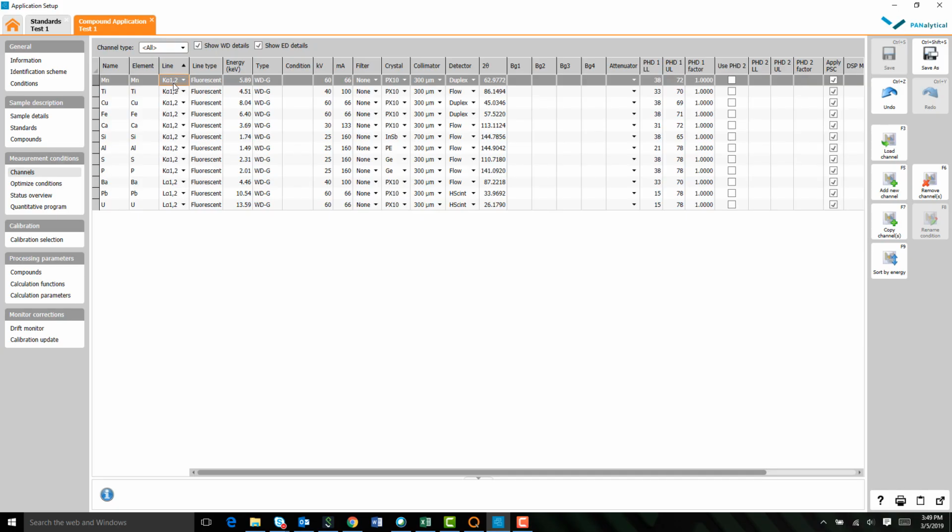You might have overlaps. You might have a lot of intensity from a certain element, and you might not care about K alphas. You might want to use a K beta. Perhaps a K beta is not giving you overlap issues, so you could use K beta if it has high enough intensities, and you won't have to worry about a K alpha overlap with another element. So there's various things you can do in here to get away from line overlap issues, or to reduce background, which increases your signal to noise ratio, which is helpful for the overall accuracy and precision of the calibration.